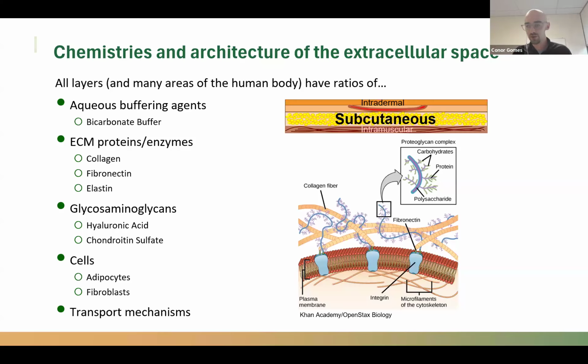Really the acceptor chamber is meant to be that sink uptake. So whether that be lymphatic, circulatory, what have you, that is supposed to represent the passage through that permeable membrane. Within the ECM system itself, it is supposed to represent the subcutaneous space in bulk, as it is a complex space. This is an acellular assay.